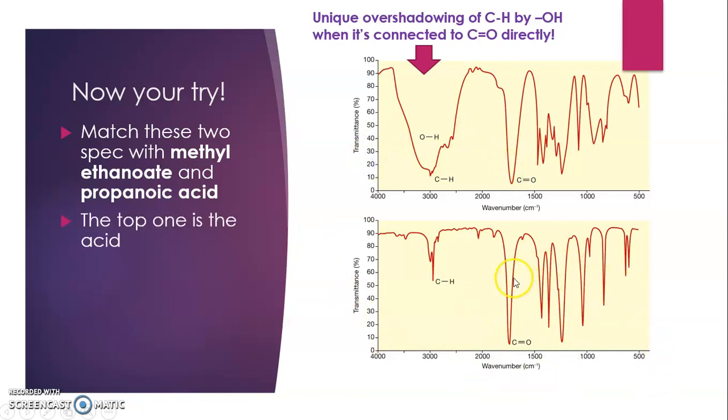And looking at the bottom graph, we do have a carbonyl absorption in the 1700 to 1800 band. Then we really have nothing else but a hydrogen-carbon, sort of hydrocarbon medium peak here. So this is unique to an ester. Okay. Since we don't really have another choice, we don't really have to distinguish if this is an aldehyde or ketone. We're really just choosing between an ester and propanoic acid. Then we can basically be sure that this is the graph of an ester.